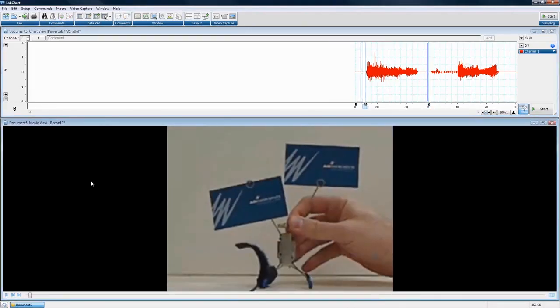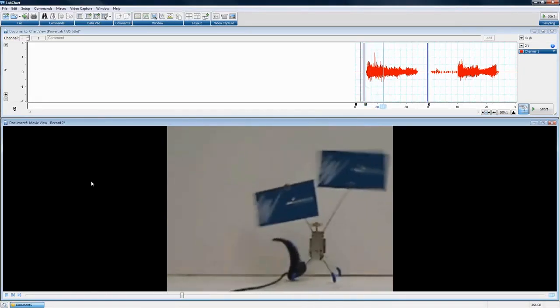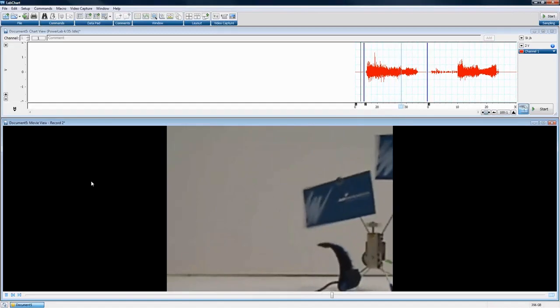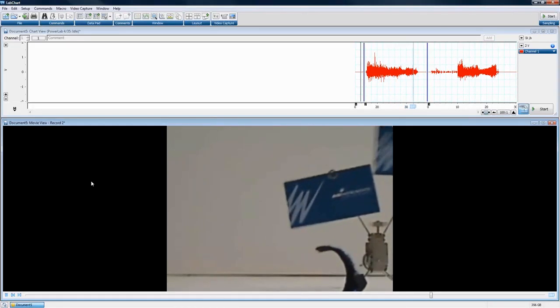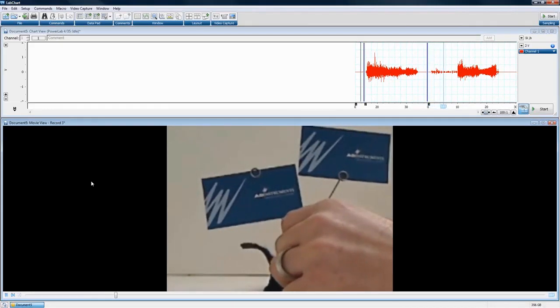We play. We skip across, and we go back. We go to where we actually let the device loose after I wound it up. LabChart does not delete the video here. It only deletes how it's indexed to the video and what data is present in the file. So it will not do any sort of video editing in that regard. So we should have the full file out in the folder that LabChart creates for the video files.